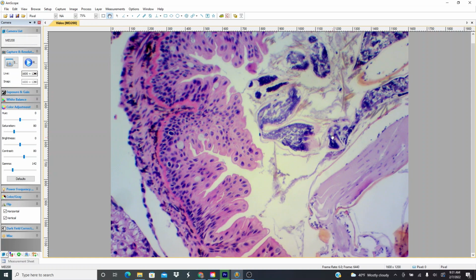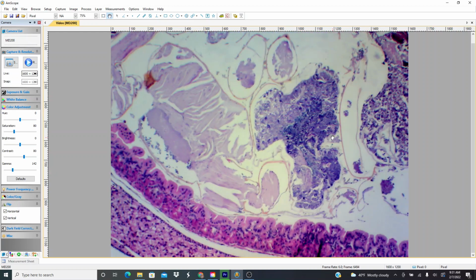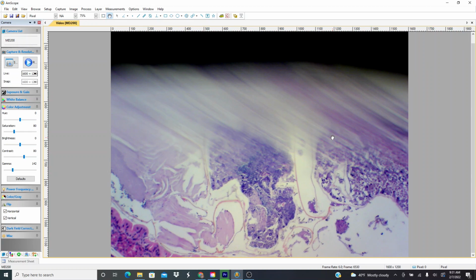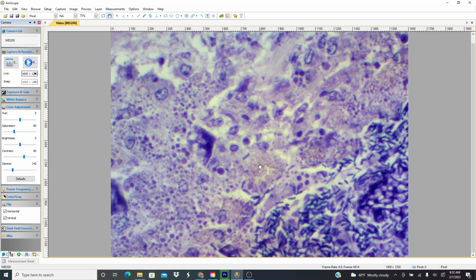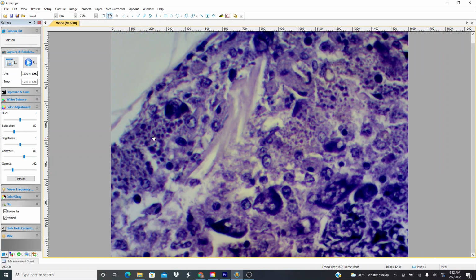You can see this material inside this area, contained within this structure. This is ingested material. This is whatever this thing ate. We're not going to be able to really figure out what it ate for sure, but you can see almost certainly there's these small organisms here, I believe fungal organisms of some kind, growing in the gut. If we saw this in a human, we would probably just call it Candida, but I'm sure it's not the same species.